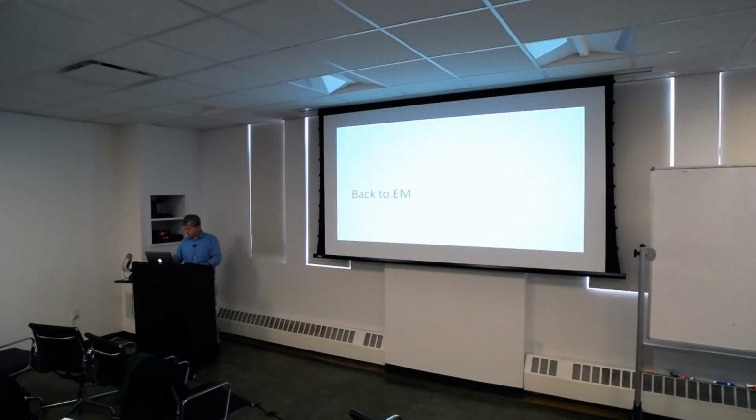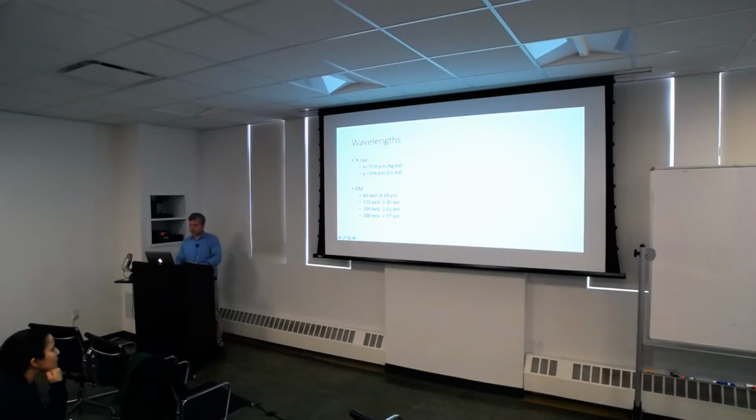So, getting back to EM. The wavelengths, again, you're probably familiar with this. X-ray wavelengths are, say, 150 picometers, but EM wavelengths are much, much smaller. Even at 80 kV, you're at 4 picometers, and at 300 kV, you're down to 2 picometers.